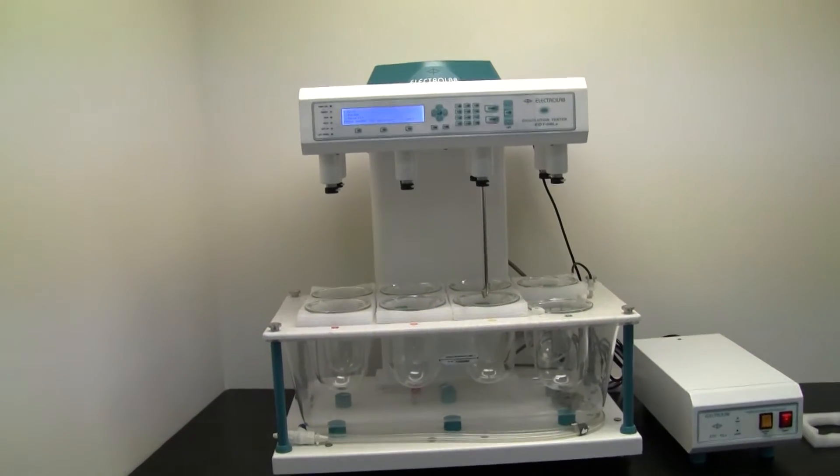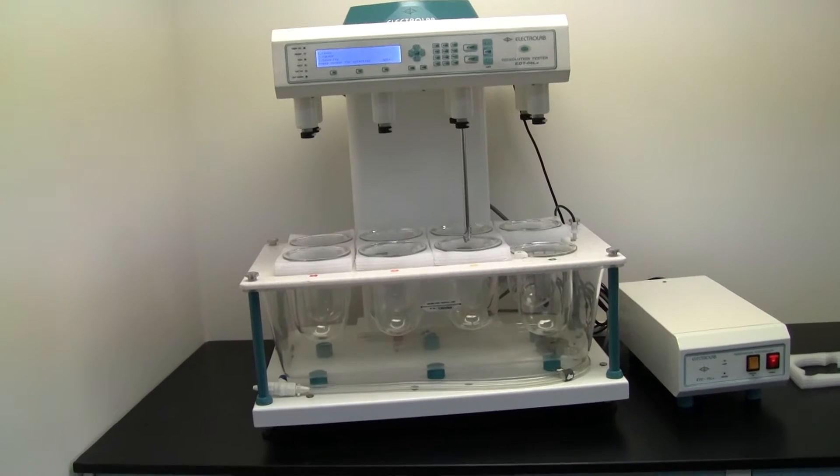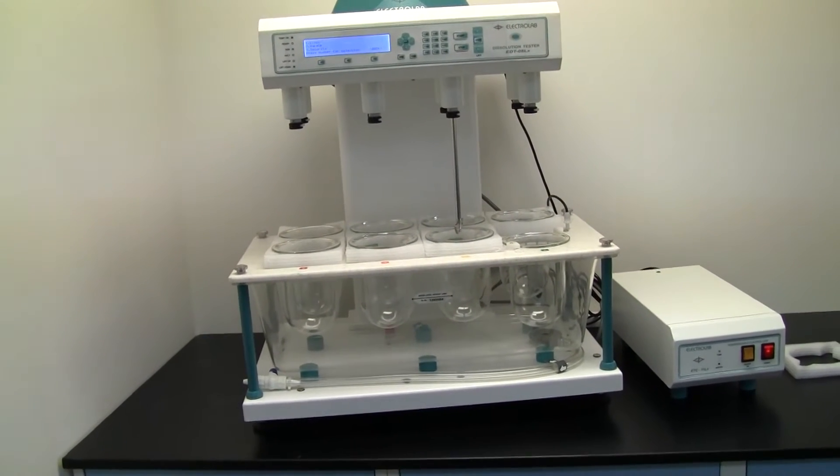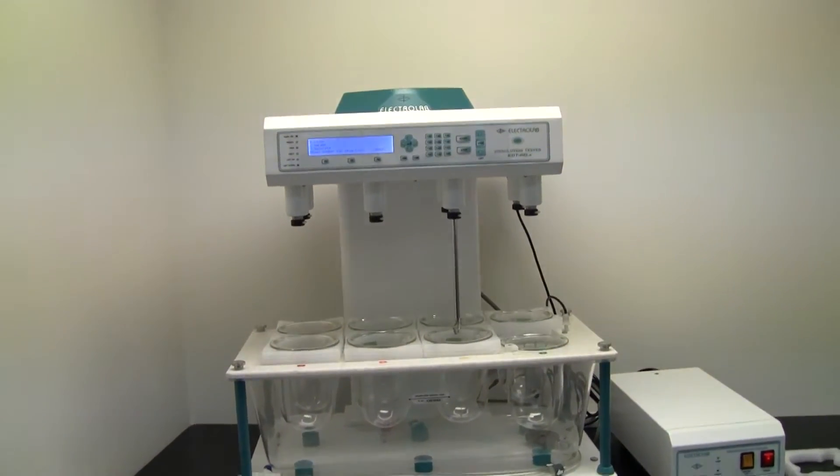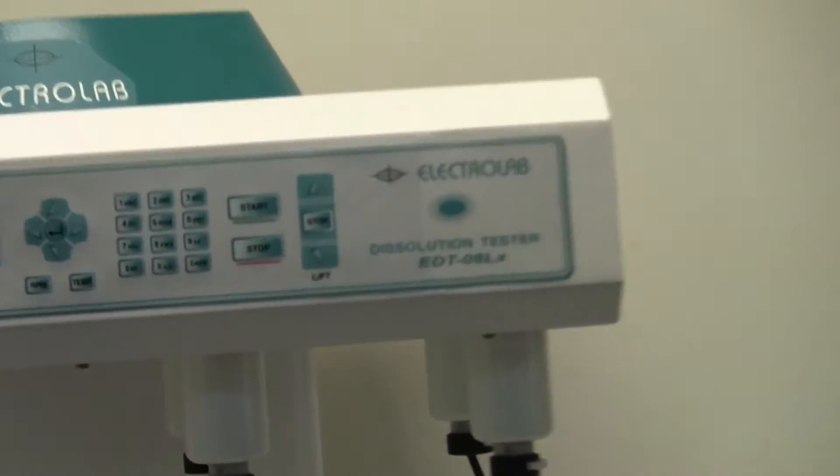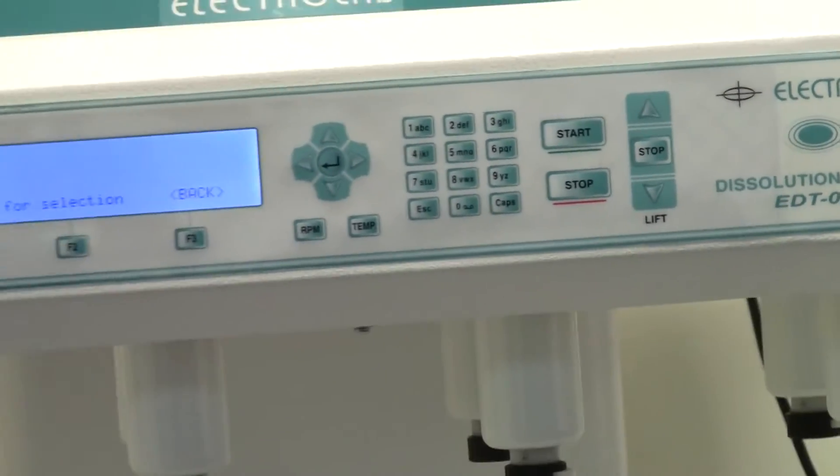Hi, this is Michael Naitow from HitechTrader. Today we're looking at the Electrolab Dissolution Tester, model EDT-08LX. This is a brand new unit right out of the box.